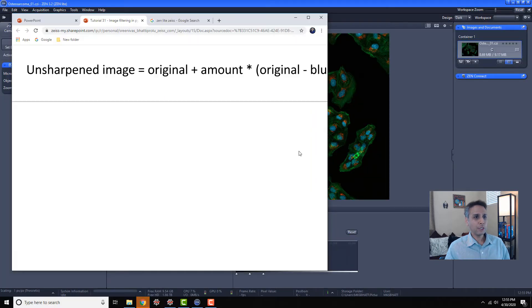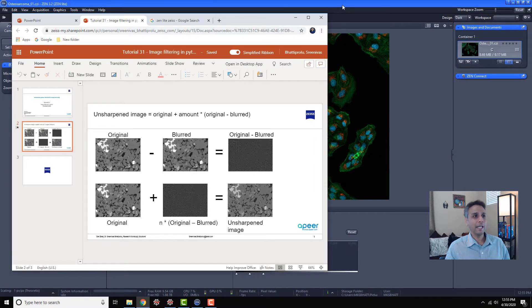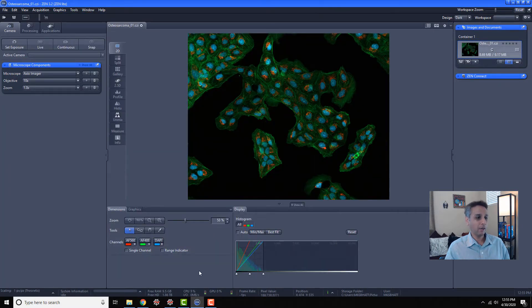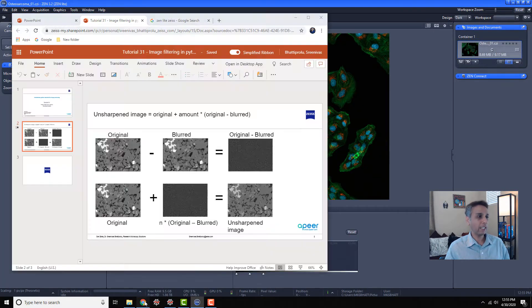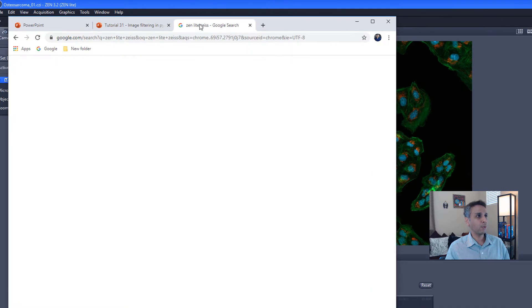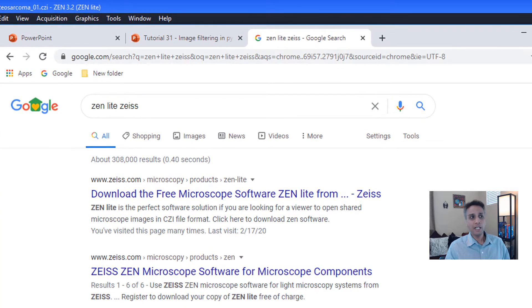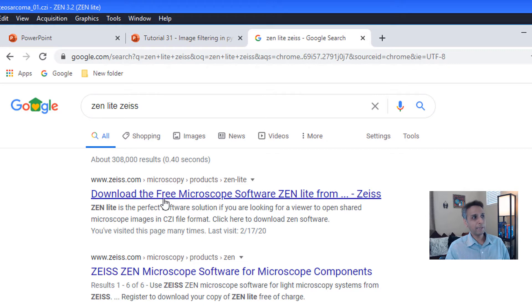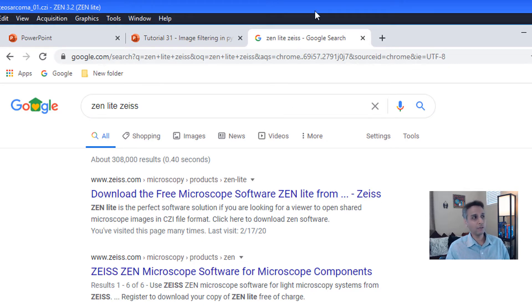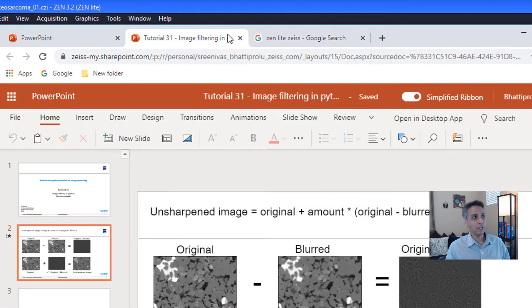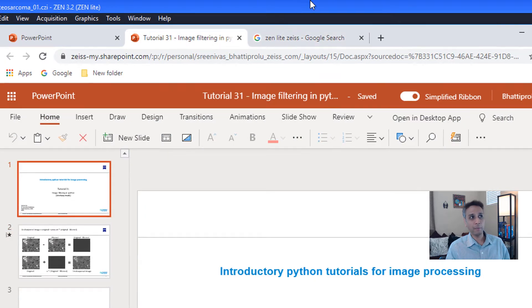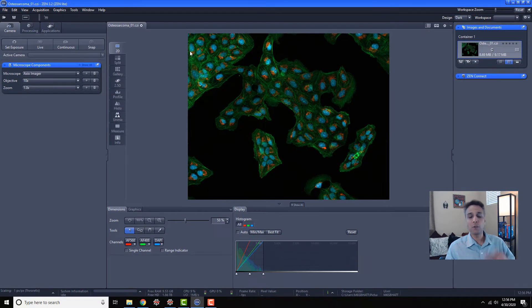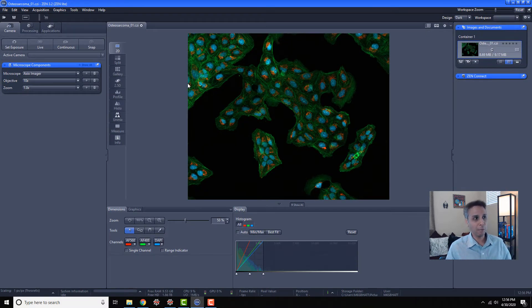So quickly switching to Zen, I have Zen in the background here. In case you wonder how to get Zen, go ahead and type Zen Lite Zeiss and typically it's the first link that you're going to find. This is a free software that you can use for your image processing and it can be enhanced by additional modules.